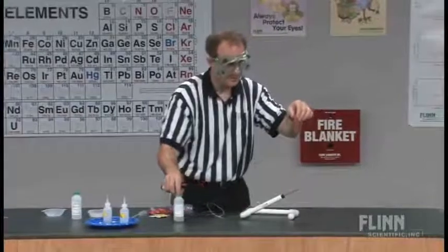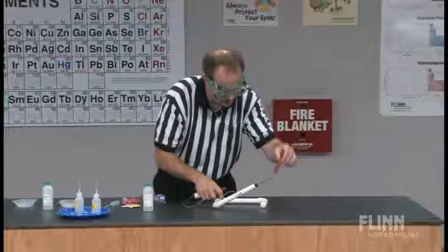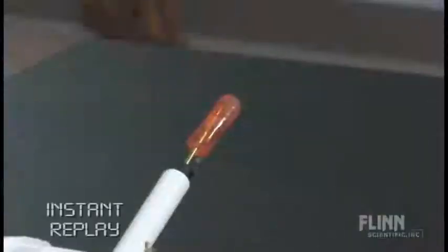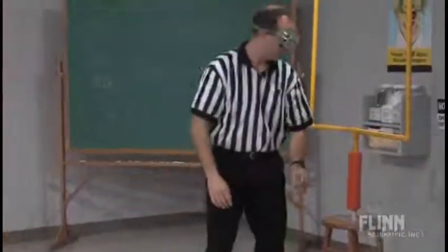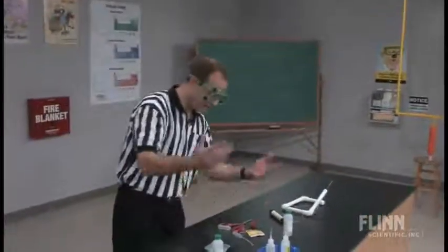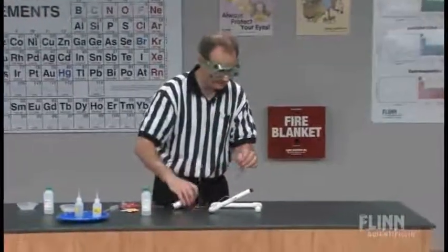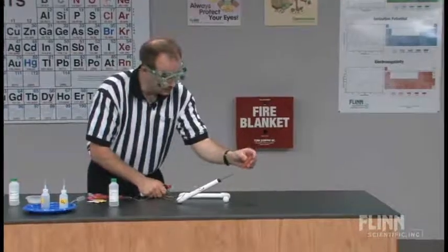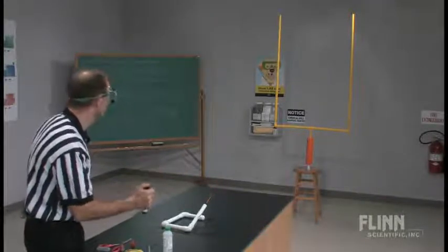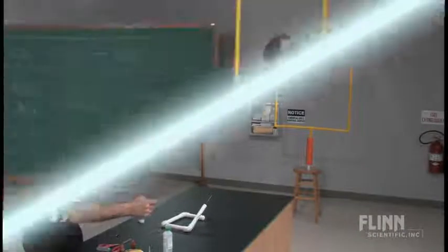So over here I go. I check this, I see sparks here, I aim for the goalpost, I put this on here — and there! That's what we're talking about right there. That's an excitement you just don't get everywhere. We can pick that bulb up. That sure was a good one. Normally, the hydrogen and oxygen generators get even better because we've gotten rid of the extra air at the top of each generator. I'm going to slide it over the tube again. I see a spark — here we go. One, two, three — firing! There we go! Another dinger! Two for two! You can see we have a little bit of water on the wall.